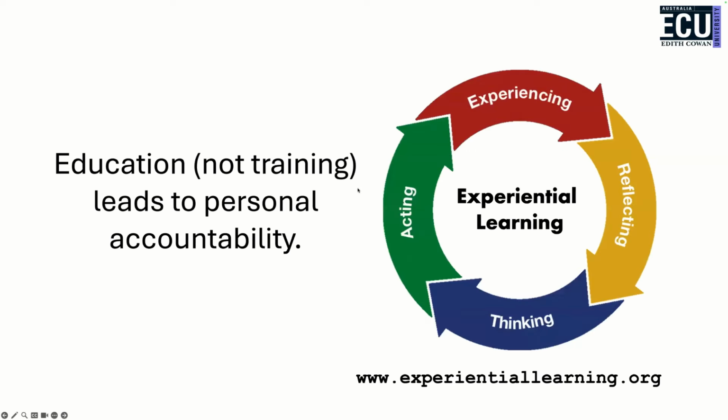And the other thing that I've really leaned into is this idea of experiential learning, where you experience the software, you reflect on what it's doing, you think about how it's functioning, you then maybe change something, and then you experience how that change affects the data, you think about it, and then you go round and round in this loop. And by creating software tools which enable experiential learning, I think that people can then be more critical of their own data, understand their own data even better, and ultimately become accountable before they go on and do the statistics, which hopefully is accountable too.